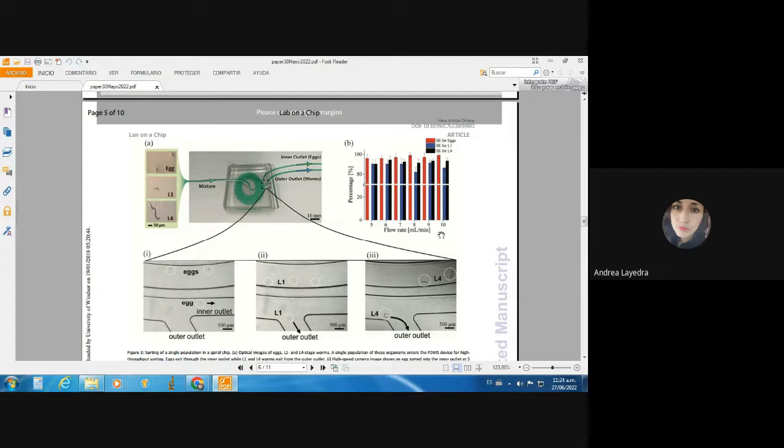the efficiency significantly increases. This improvement can be explained by the increasing centrifugal force in the spiral channels, where the centrifugal force depends on the tangential velocity in a curved channel.